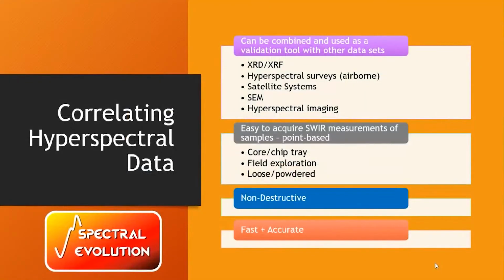Okay, so many of you working on porphyry deposits are probably using other data sets from various other types of technology. Now, the beauty of using a field portable spectrometer is that the data is very complementary and can be used as a validation tool as well.